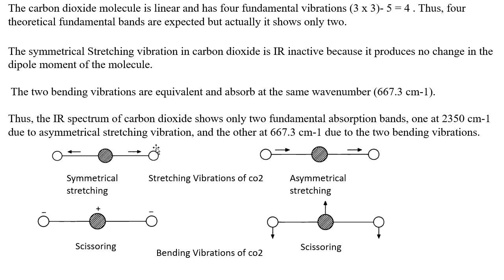It is IR inactive because it produces no change in the dipole moment. The symmetrical stretching of carbon dioxide produces no change in dipole moment, and so it is IR inactive.